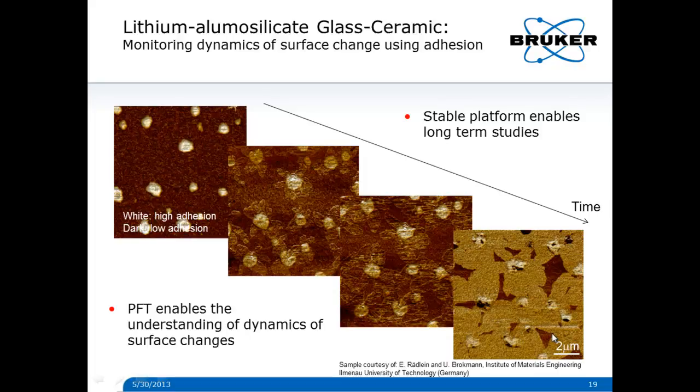But this takes 5 or 7 hours. This set of images was actually over about 5 hours. And the drift rate of the system was about 0.1 nanometer per minute, so it was easy to track these features.